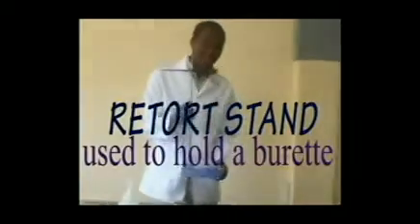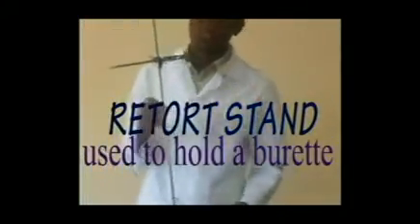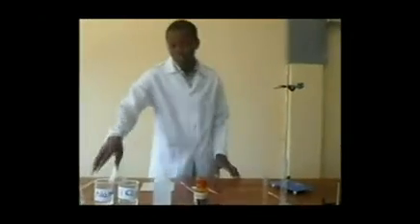The last apparatus is retort stand. This is an apparatus that is used to hold the burette. Chemicals required. Chemicals required in this titration are sodium hydroxide solution, hydrochloric acid, distilled water, and the last one is methyl orange as an indicator.